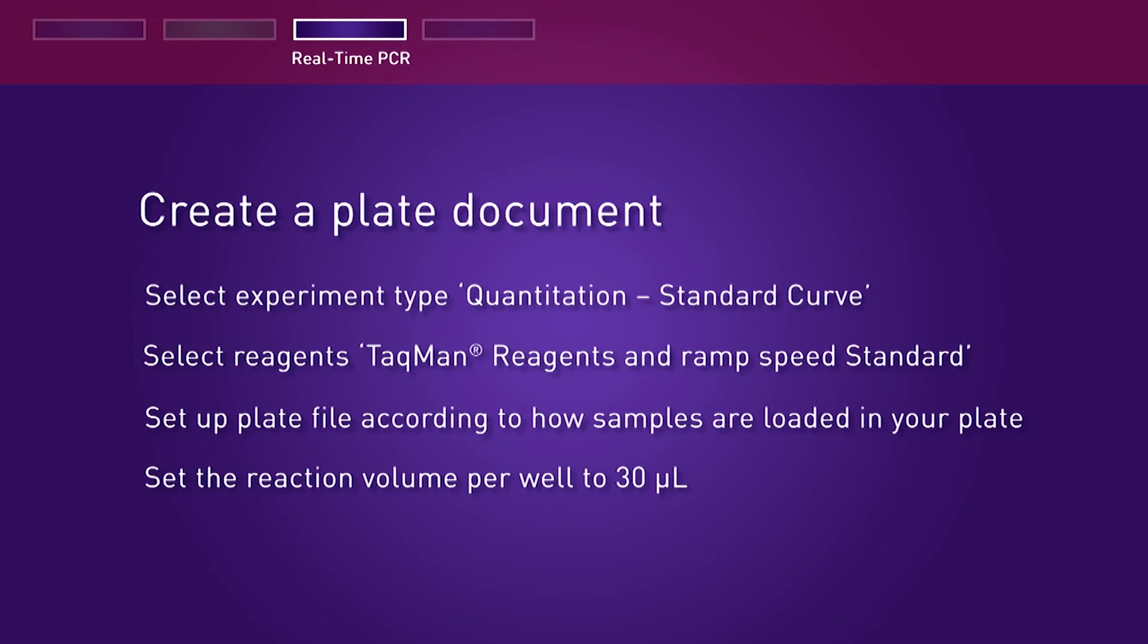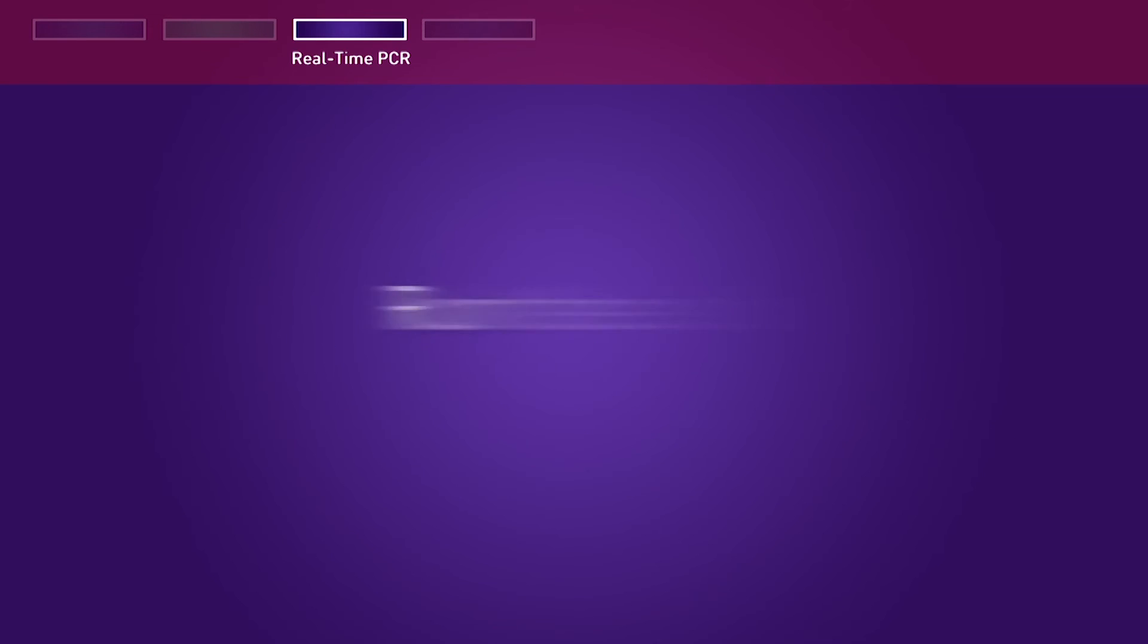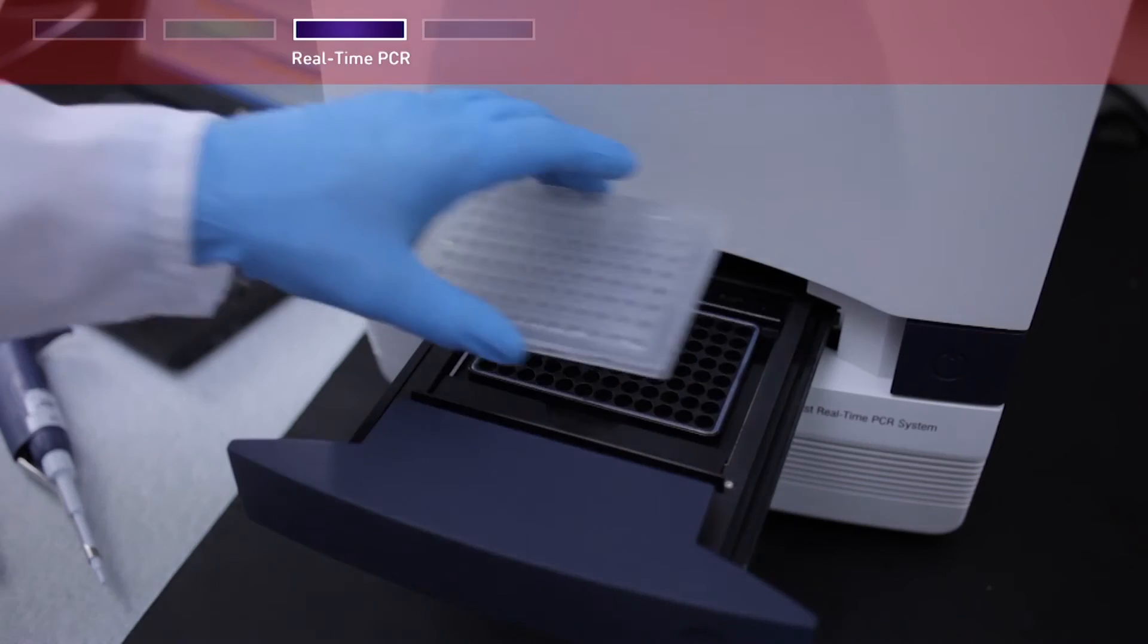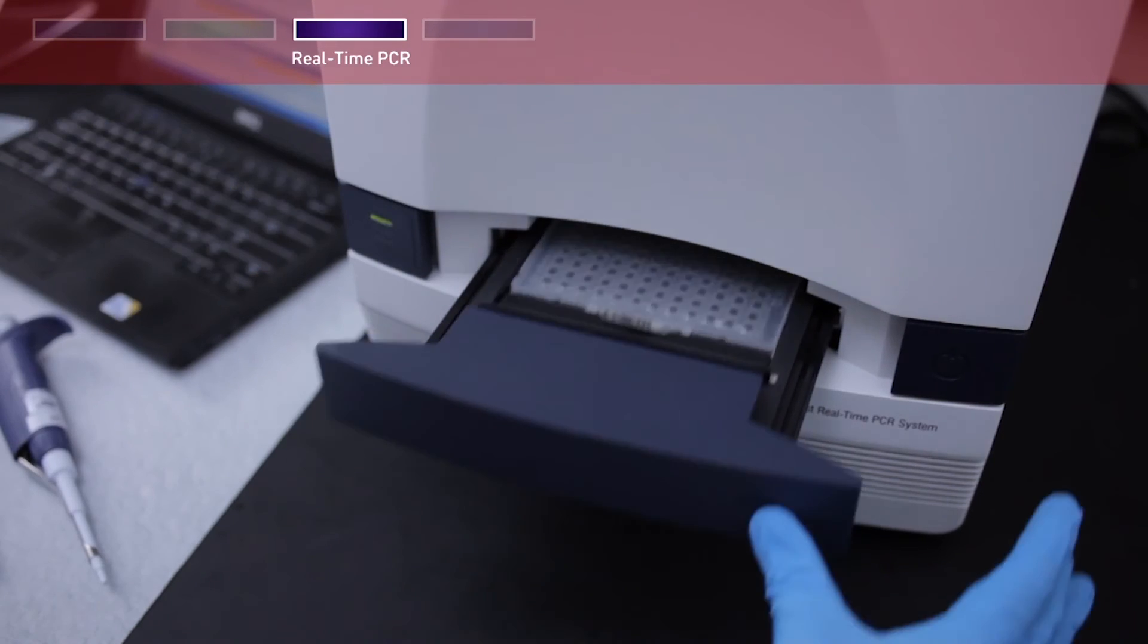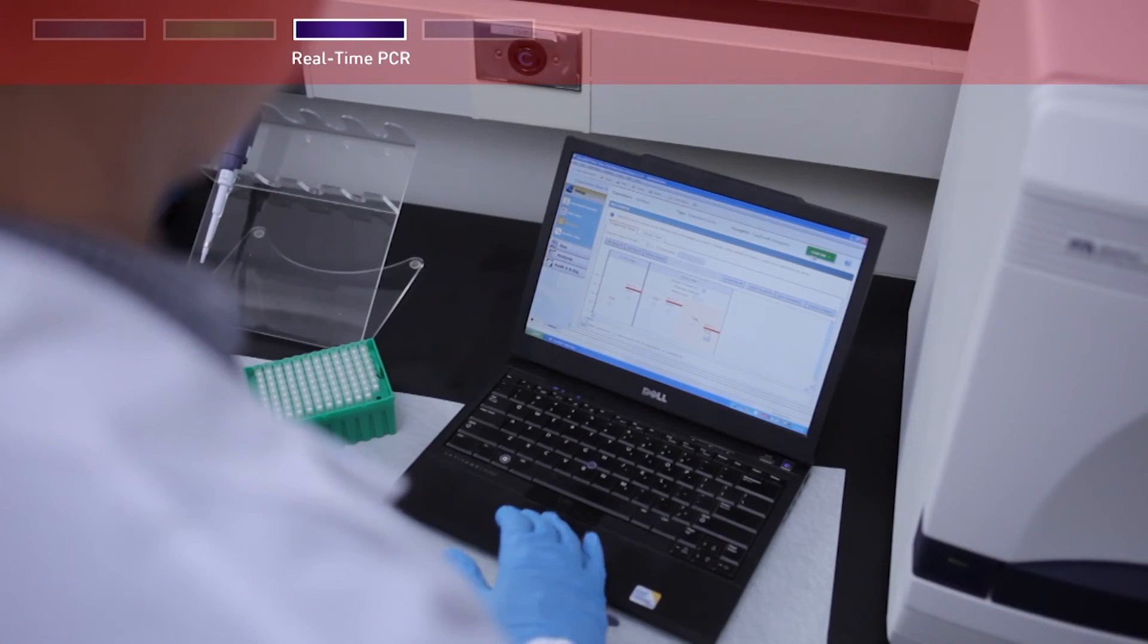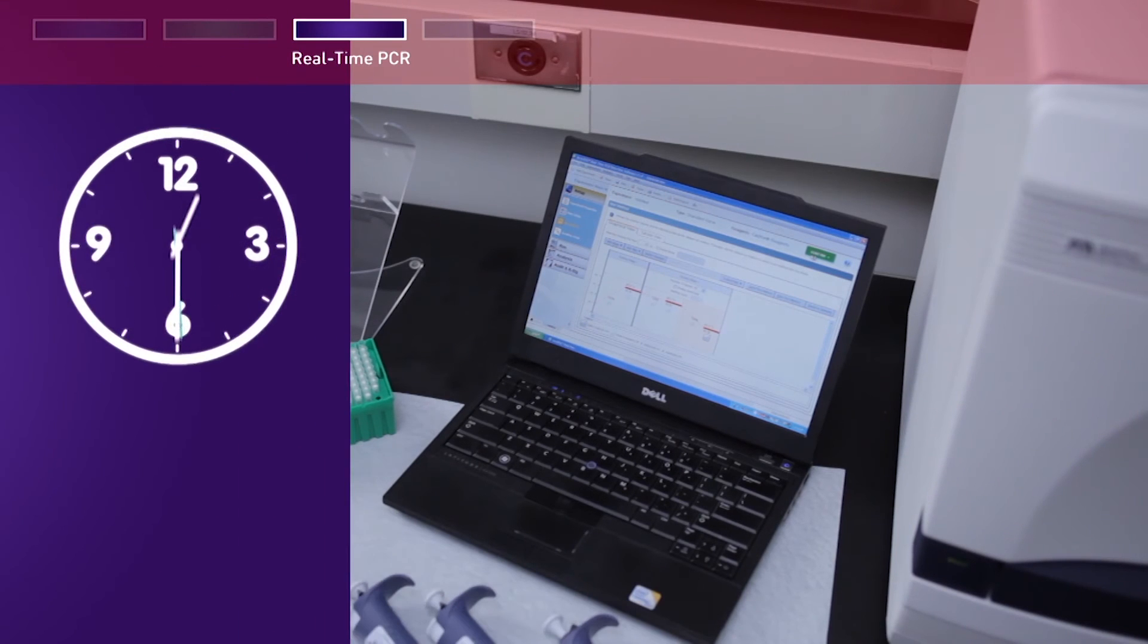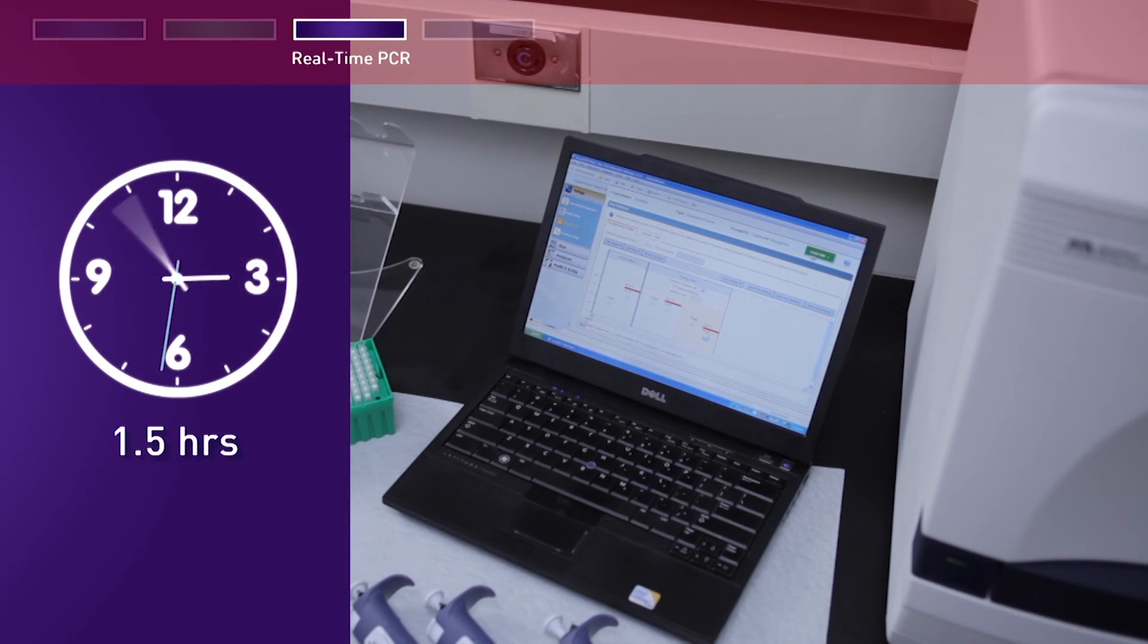Set the reaction volume per well to 30 microliters. Load the plate into the instrument and click Start Run. A residual DNA run is approximately 1.5 hours.